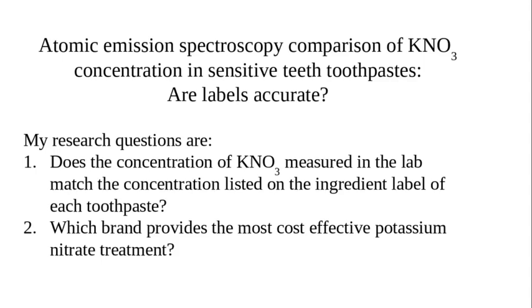As I mentioned at the beginning of my presentation, the title of my project is Atomic Emission Spectroscopy Comparison of Potassium Nitrate Concentration in Sensitive Teeth Toothpaste, or Are Labels Accurate? I am interested in seeing if it is worthwhile to pay for Sensodyne if I can get the same benefits from a less expensive alternative.